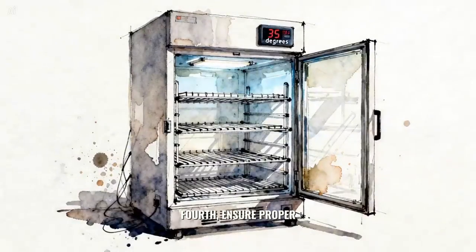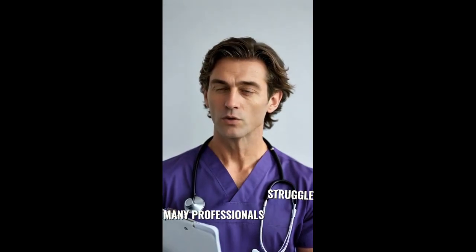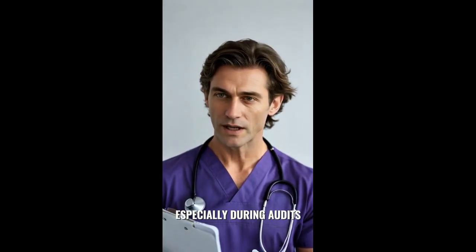Fourth, ensure proper incubation conditions, typically 30 to 35 degrees Celsius for mesophilic organisms and 55 degrees for thermophilic organisms for 5 to 7 days. This is where many professionals struggle, especially during audits.